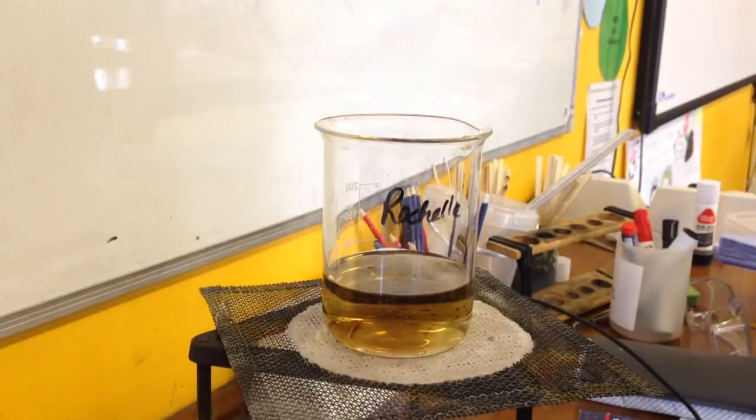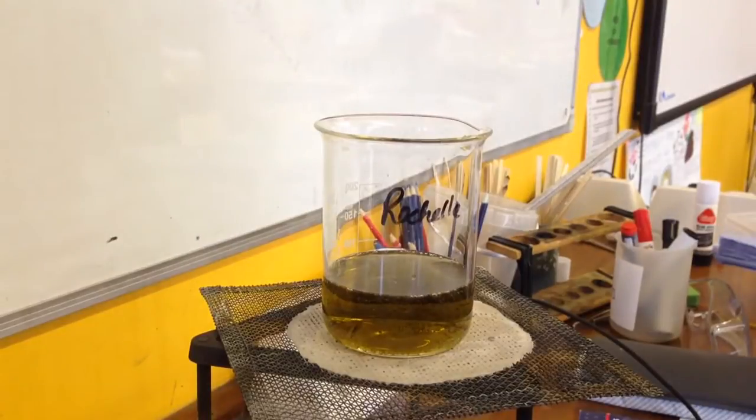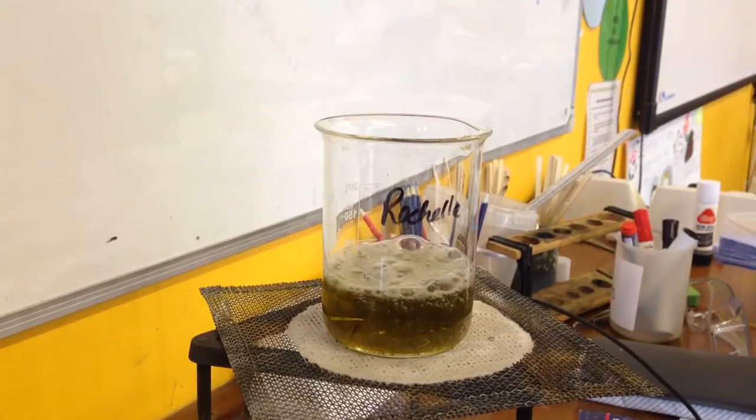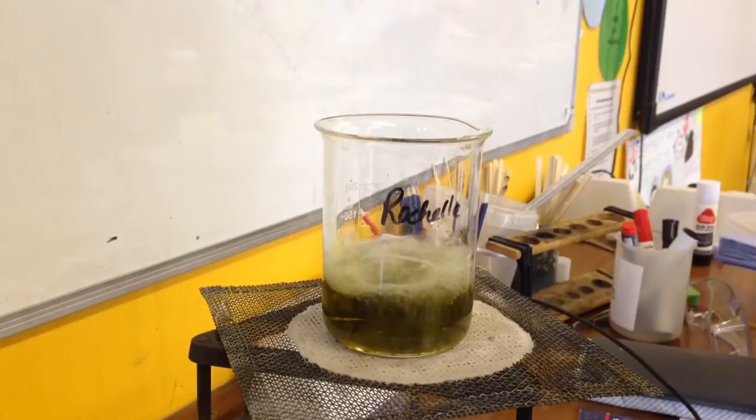I'll pop it in there and you can see the color has immediately changed to green and we can hear and you can see that the bubbling has started to increase a lot more.